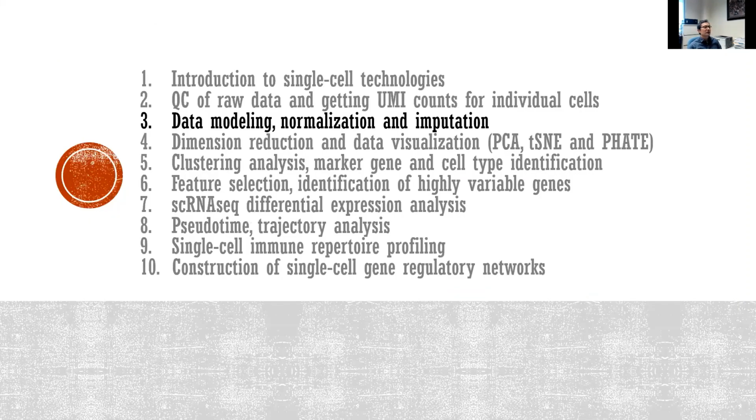Today, we are going to talk about data modeling for single-cell RNA-seq data and how to do normalization, and we'll mention imputation methods.